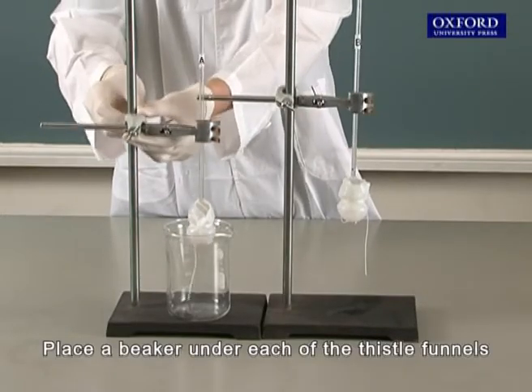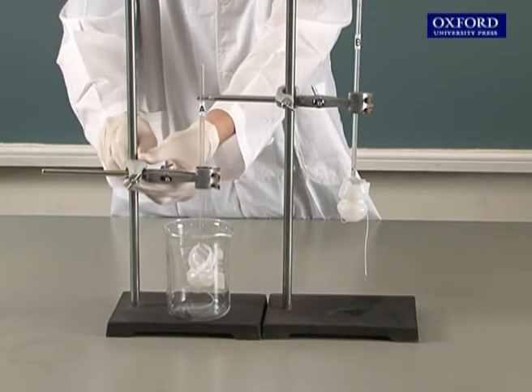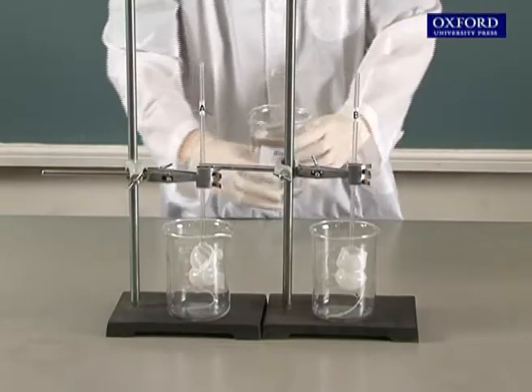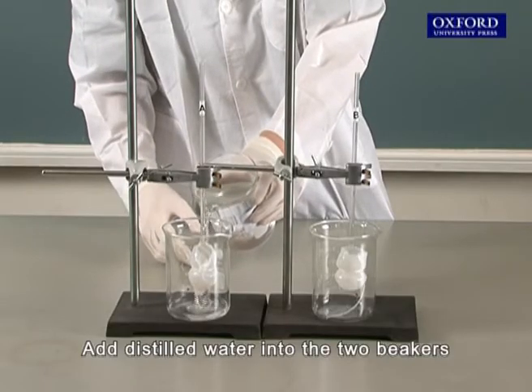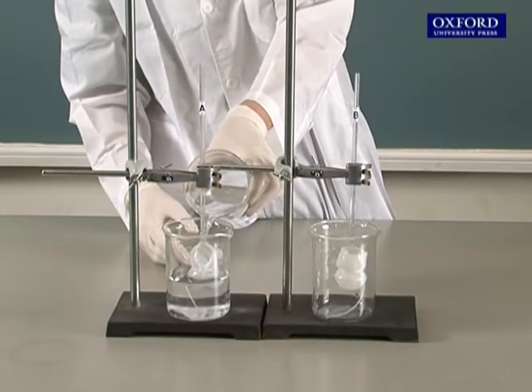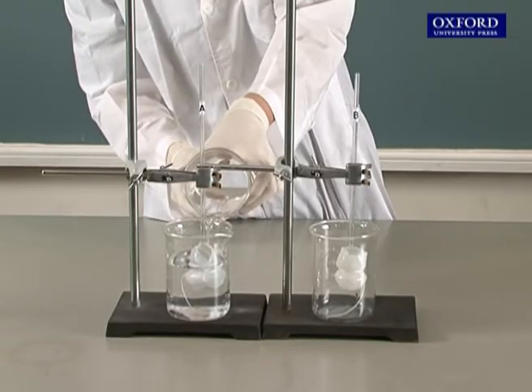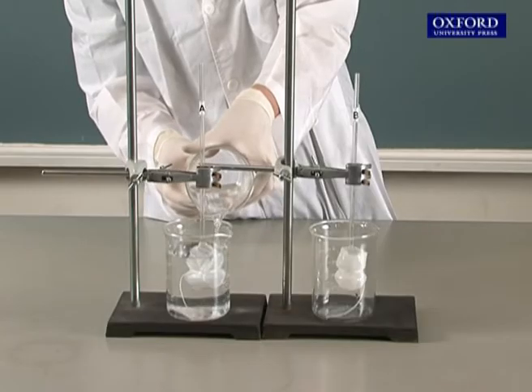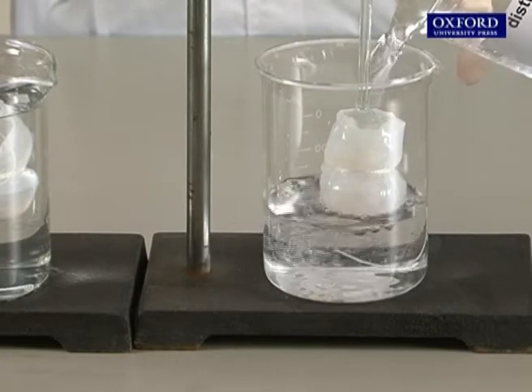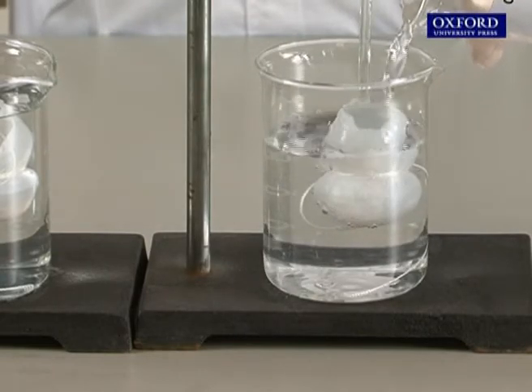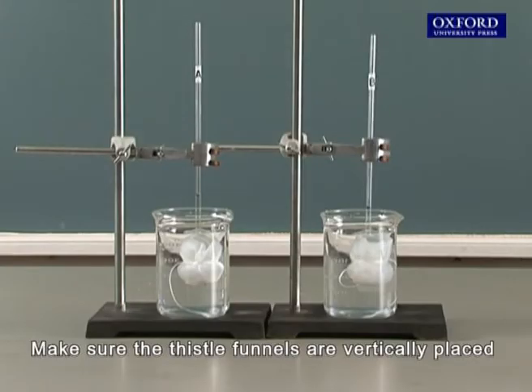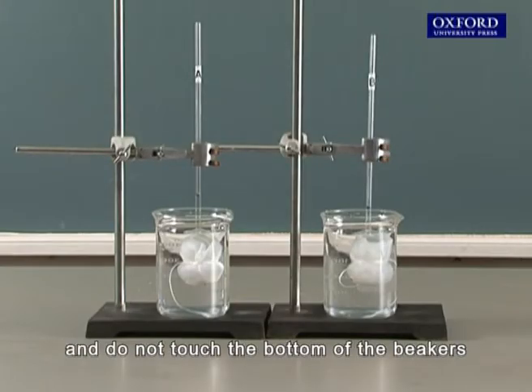Place a beaker under each of the thistle funnels. Add distilled water into the two beakers until the bulbs of the thistle funnels are completely covered. Make sure the thistle funnels are vertically placed and do not touch the bottom of the beakers.